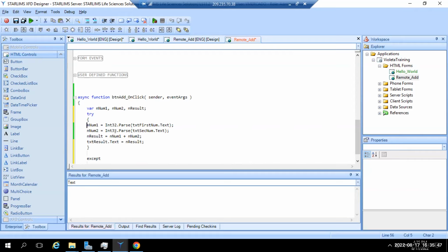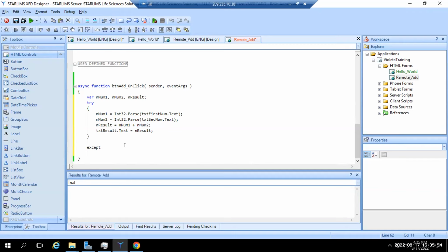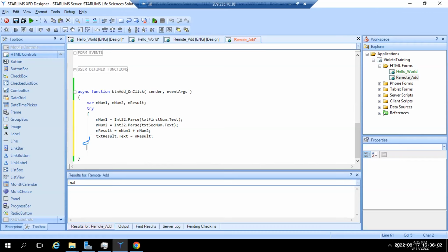Okay. You can multi-select and hit tab, by the way. But that's fine. Okay, and then it's a catch over here. Yeah. Right after this curly, just type catch. Like this, okay. Yeah, just make it a new line. Okay, and then I believe it's open parentheses, and then hold on, let me take control here.